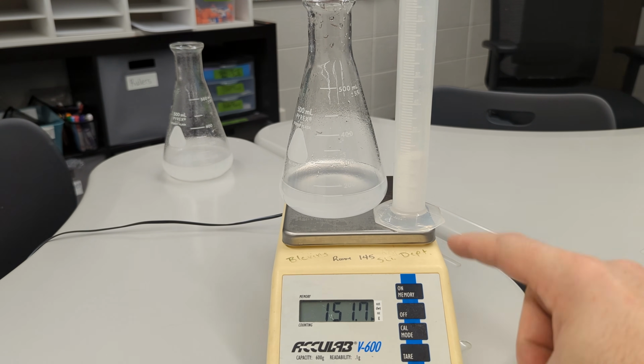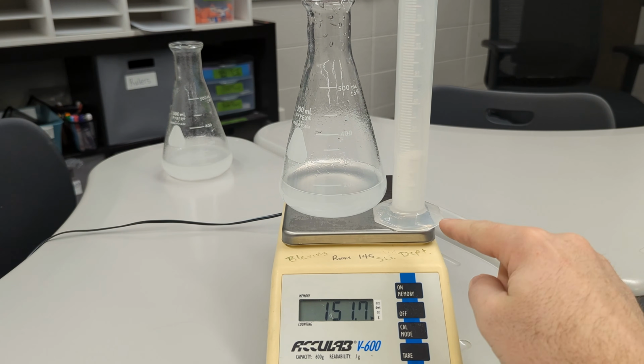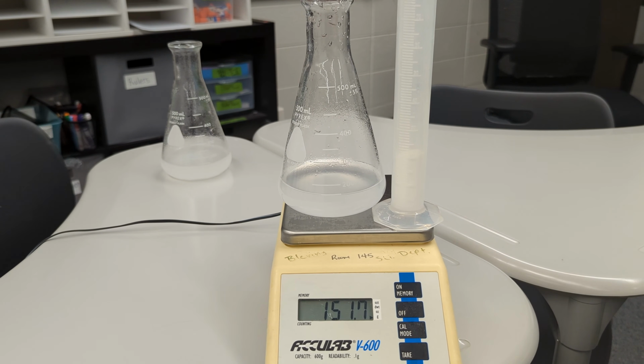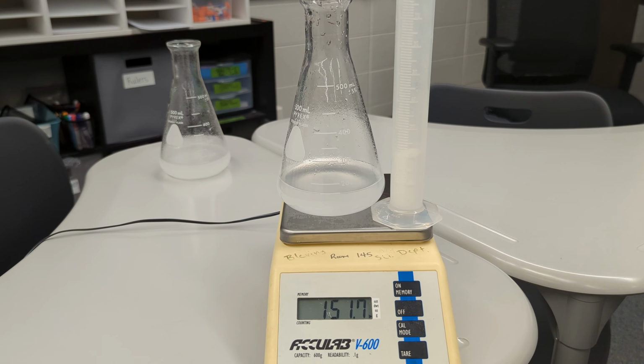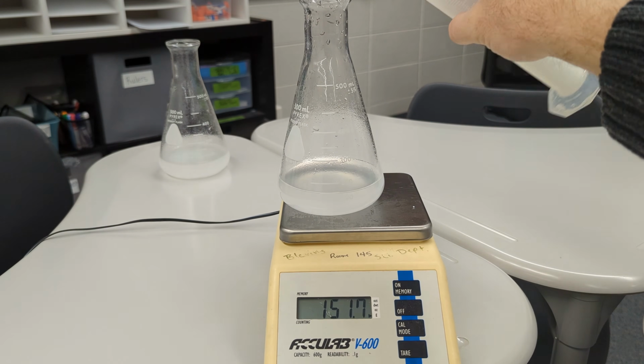It's important to note that before I set these on the scale, I tared both the Erlenmeyer flask and the graduated cylinder, so those weights are not being included in the reaction. But just to keep everything the same, I'll make sure that the graduated cylinder goes back on the scale after I pour in the solution. So let's look and see what happens. The mass right now is 151.7 grams.